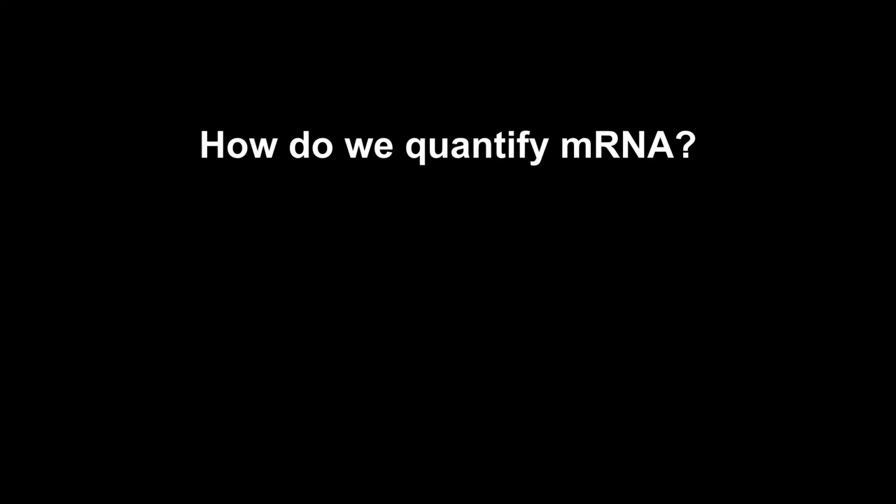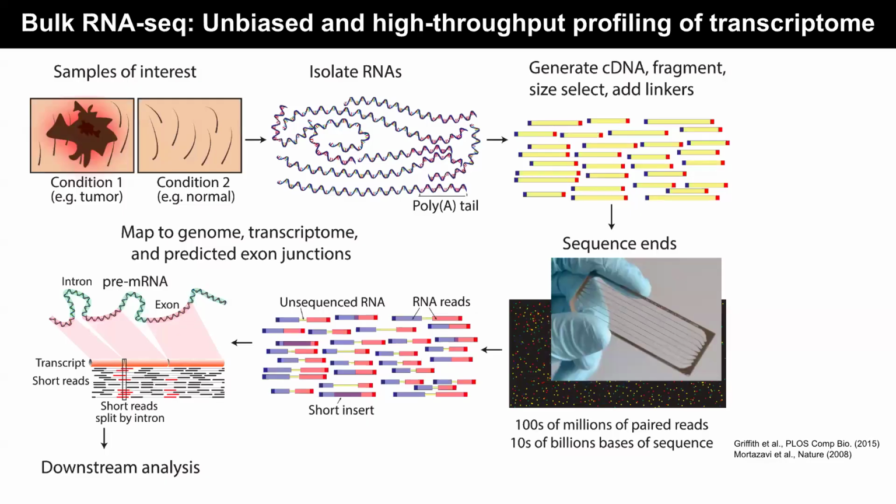Okay. So you will go from this direction to this direction. How do you do it? Yeah. The whole of this is RT, the reverse transcription. Just like DNA polymerase goes from DNA to DNA, there is an RT polymerase, reverse transcriptase. You take the RNA copy, convert it back to DNA, you can throw this back onto your sequencer, and you have your sequences. That is exactly what the technology called RNA-seq tries to do.